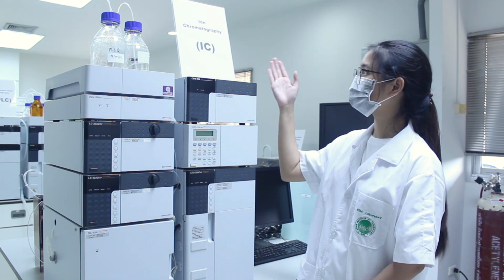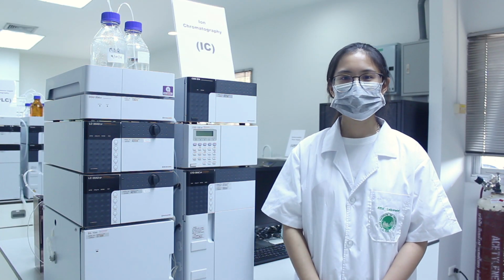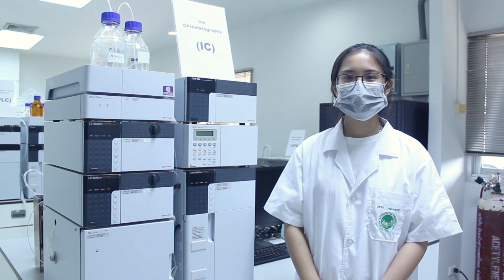Asian Institute of Technology or AIT. Today I'm going to talk about ion chromatography or IC. IC is an instrument used for chemical analysis for separating ions and polar molecules based on the affinity to the ion exchangers or the column.